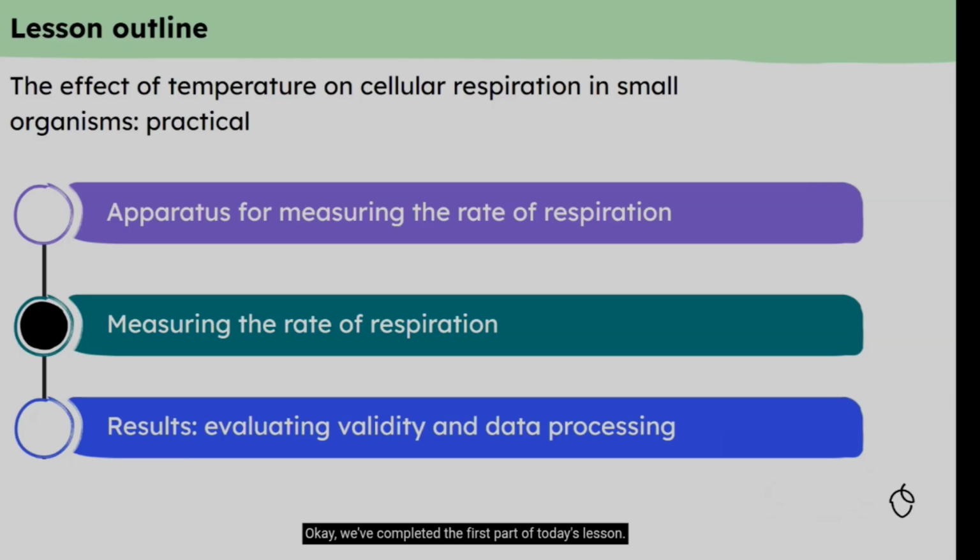Okay, we've completed the first part of today's lesson. We've talked about the apparatus for measuring the rate of respiration. And now we're going to talk about how to use that apparatus to measure the rate of respiration.